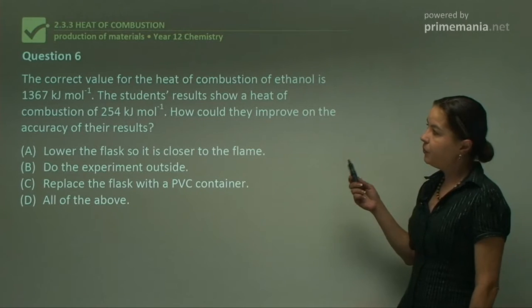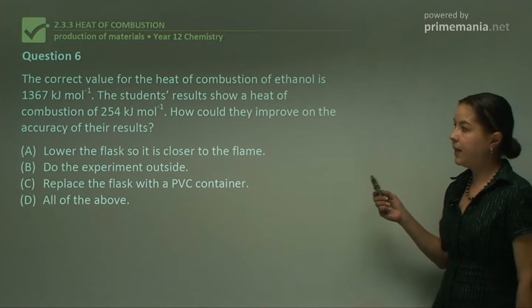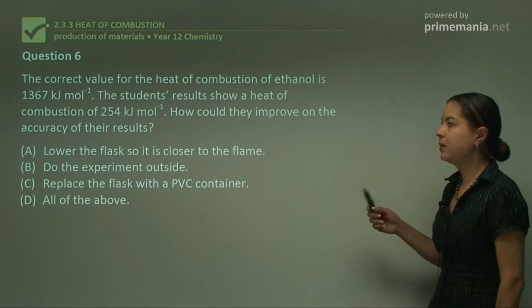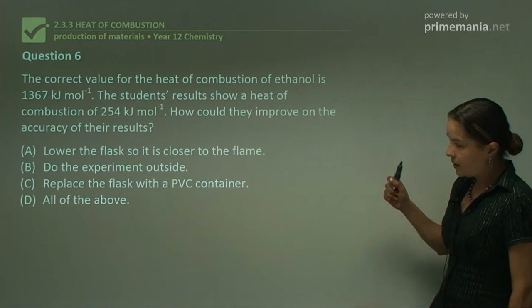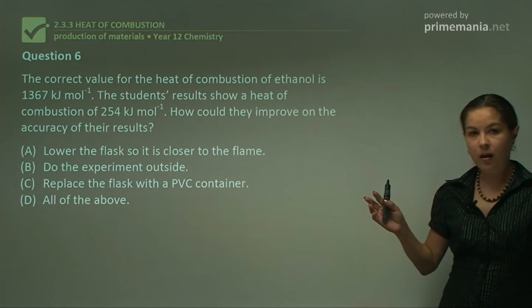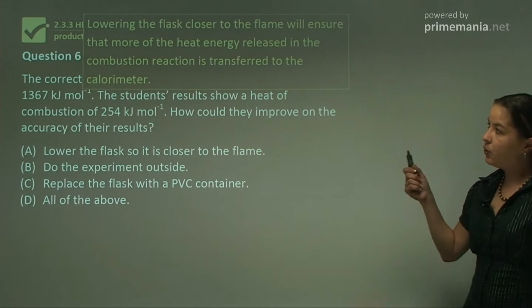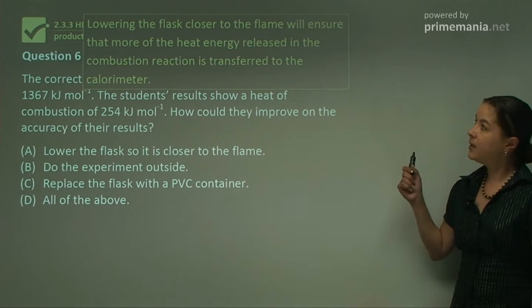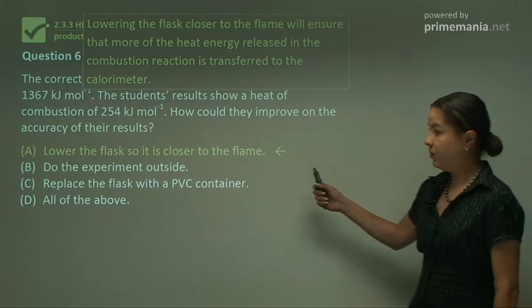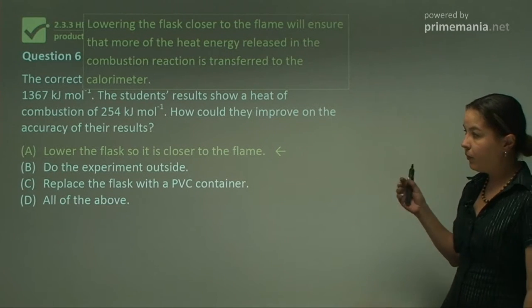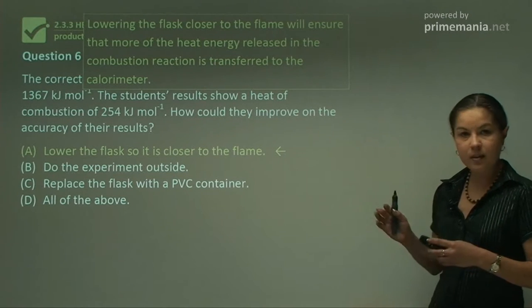Question six: the correct value for the heat of combustion of ethanol is 1367 kJ per mole. The students' results show a heat of combustion of 254 kJ per mole. How could they improve on the accuracy of their results? Now thinking about this, the main reason that probably they've got such a low value is from a draft and inconsistencies in the atmosphere. So lowering the flask closer to the flame would ensure that more of the heat energy released in the combustion reaction is transferred to the calorimeter. So our answer to that one would be to lower the flask. But another way that they could improve the accuracy would be to make sure that they had a really good draft barrier. So perhaps use more than one to stop that draft, because they might be next to a window perhaps that's open.